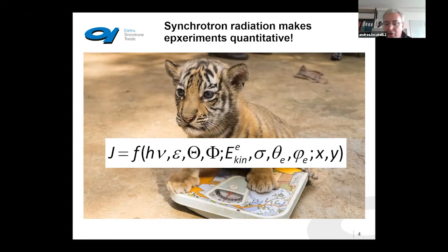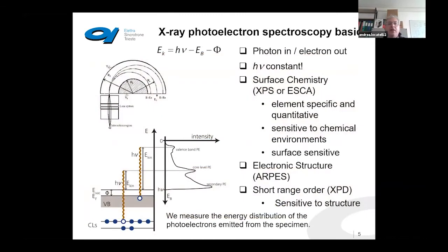And of course, if you do microscopy, you have to measure something which is very trivial: the different properties that you find across the sample. And in general, nature presents inhomogeneous material. And this is why it's interesting to perform this kind of experiments.